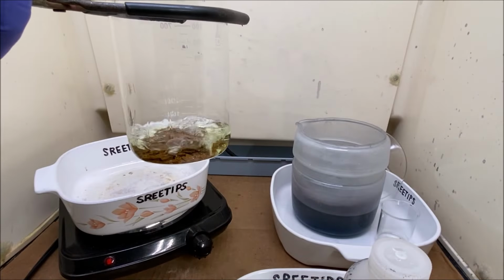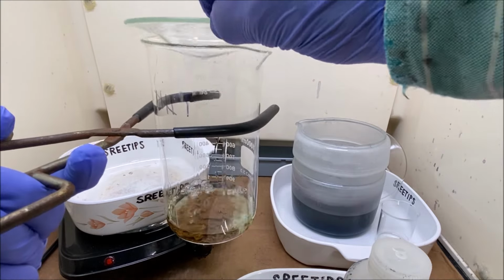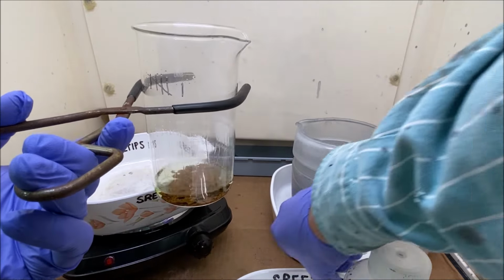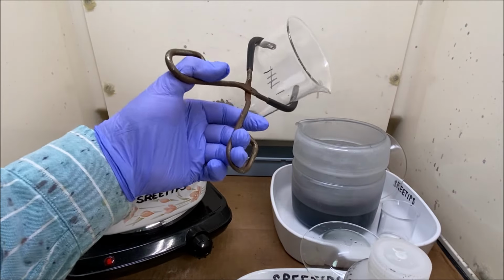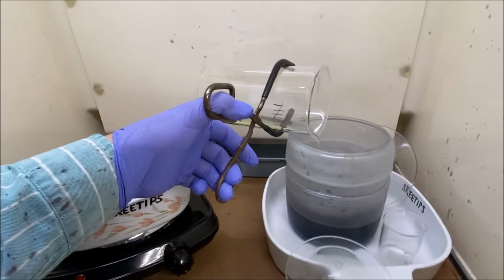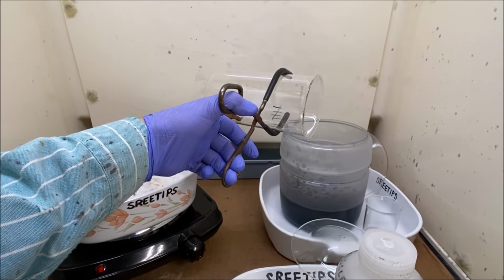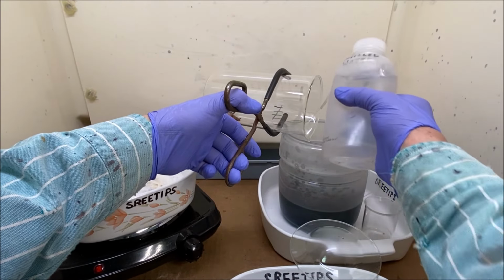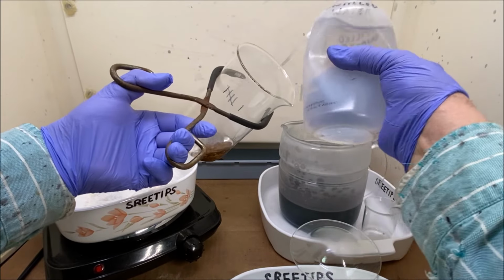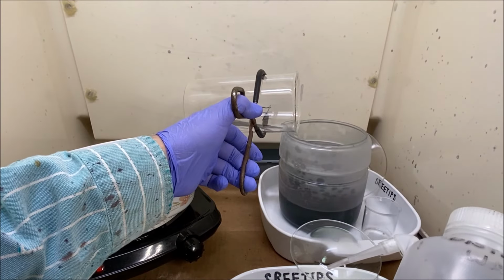We pulled all the silver, all the base metals out of here with nitric acid boils. So now I'm going to pour off this liquid. It's a yellow color, as you can see. That's probably because we put a little bit of gold in solution. Boiling nitric acid will dissolve traces of gold.